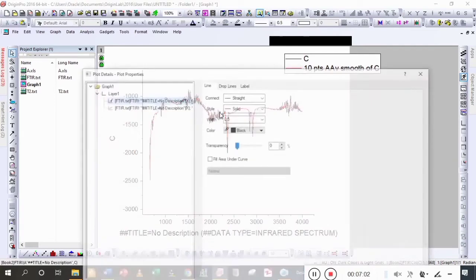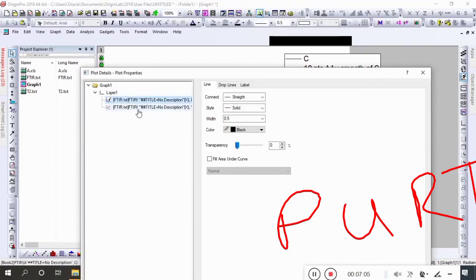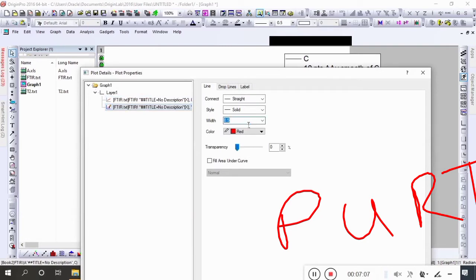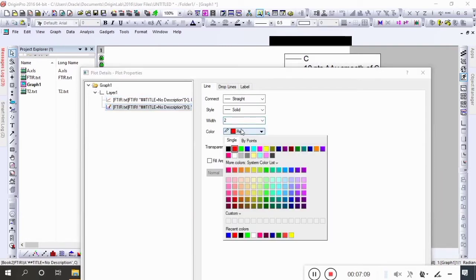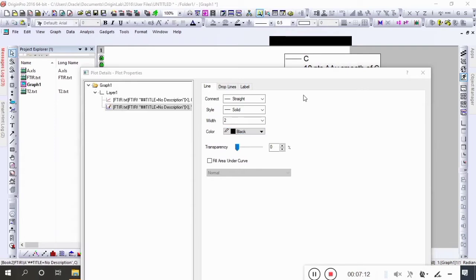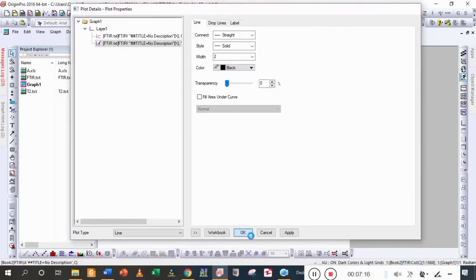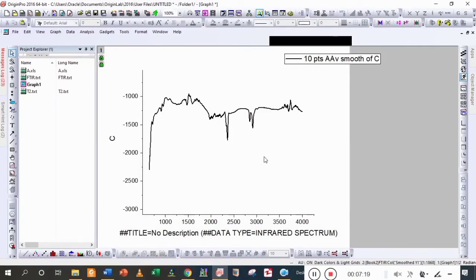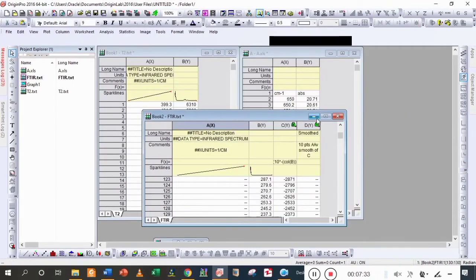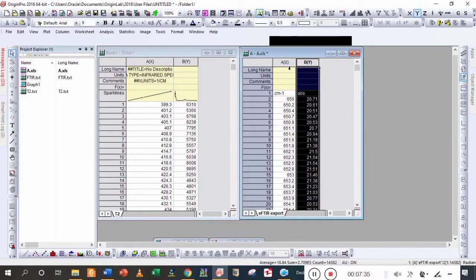A new graph is observed — the black one. Firstly we hide the previous data, and then we change the new data color from red to black. You can see that this is the new data — it is much better than the previous one, because the previous one had too much noisy data, but this data has a minimum amount of noise. Now we are going to deal with another graph.